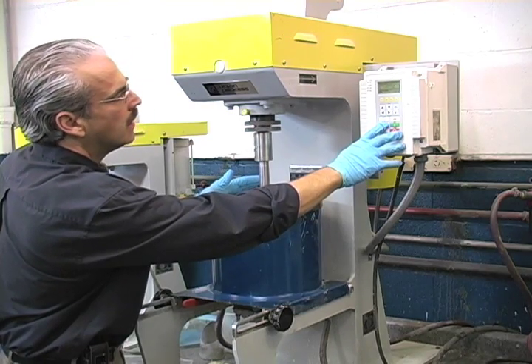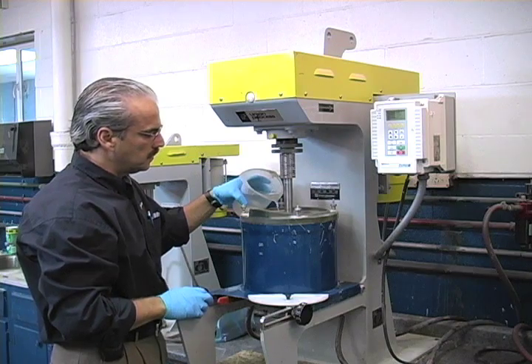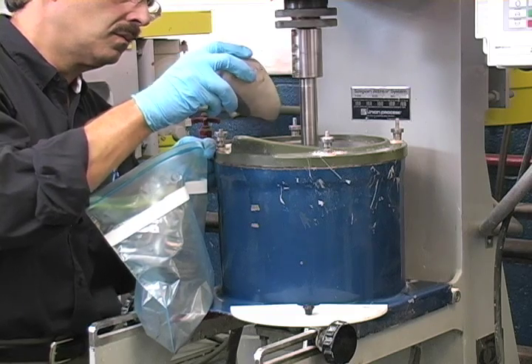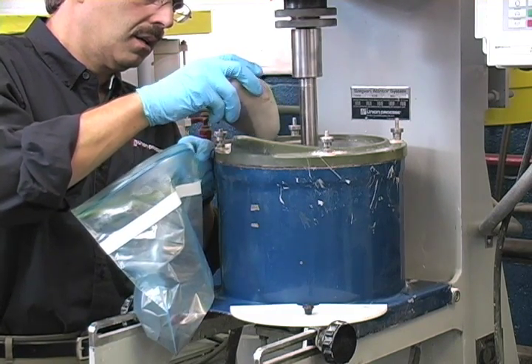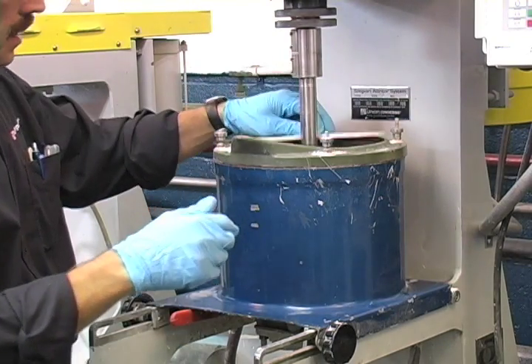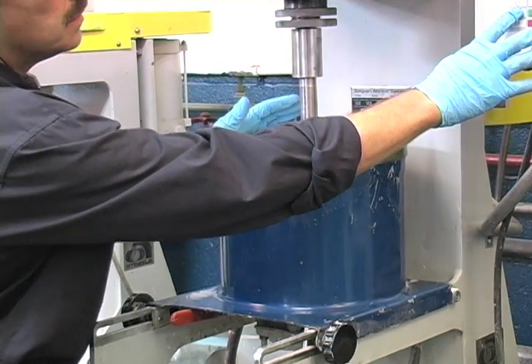Next, the mill is started on low speed. For wet grind, water or other liquid is first added to the mill. The customer's material is then slowly added into the tank to assure good dispersion and to minimize any clumping. Once the charging procedure is complete, the cover is placed over the tank and the mill RPM is increased.